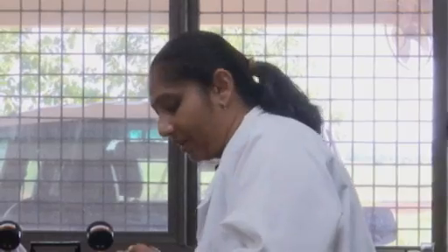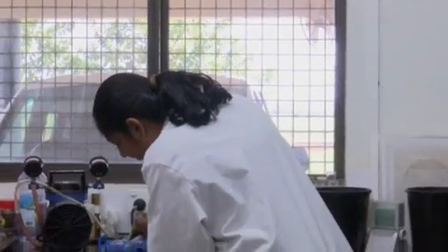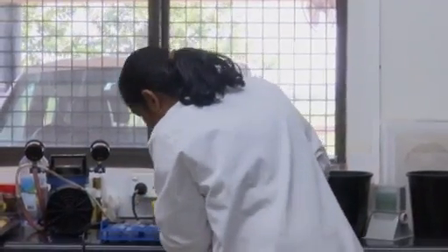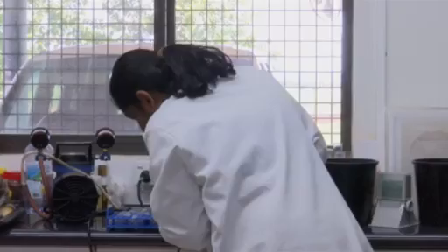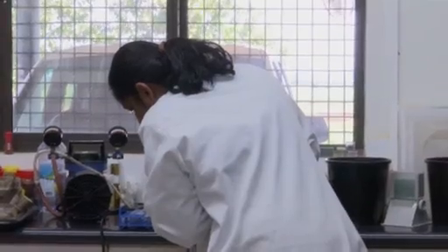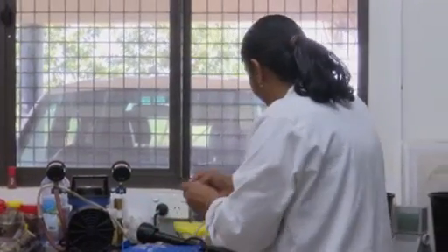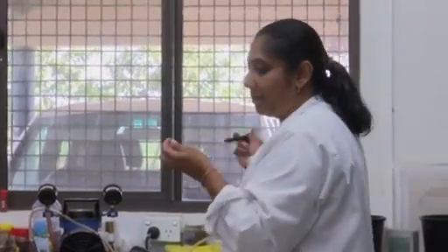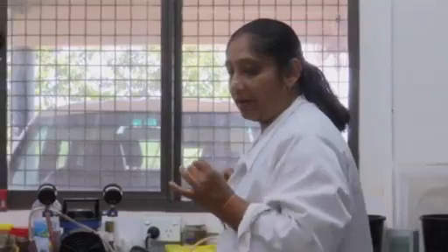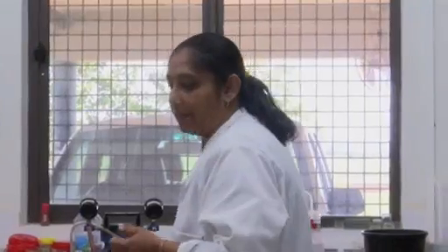vacuum pump, where we take the sap. When we collect the saps, we label them. We label the sap according to the farm number, and then we bring it to the lab. This is how we bring the samples. We store the samples in the lab, and then we do the lab analysis.